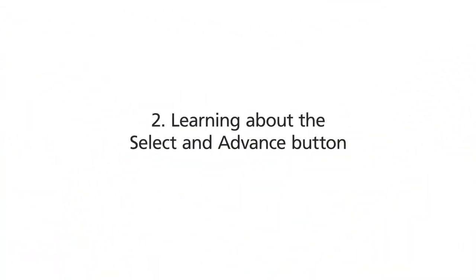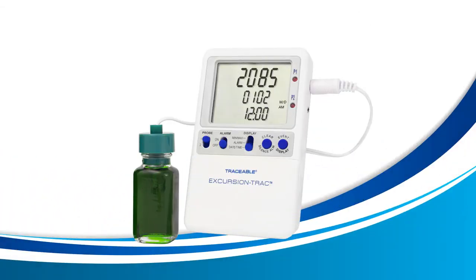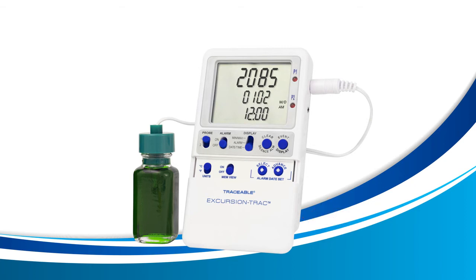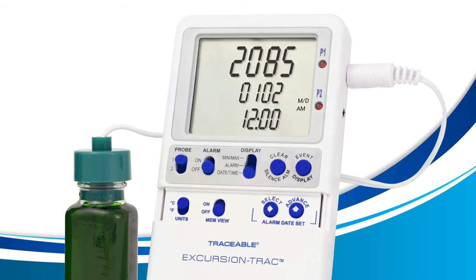Learning about the Select and Advance button. In this lesson, we'll learn about the Select and Advance button. The Select and Advance buttons are located underneath the slider door of your device. Simply slide the slider down as shown here, and you'll find the Select and Advance buttons towards the right. Using these 2 buttons, we'll be able to set our date and time. Let's learn about each button individually first before we use them together.